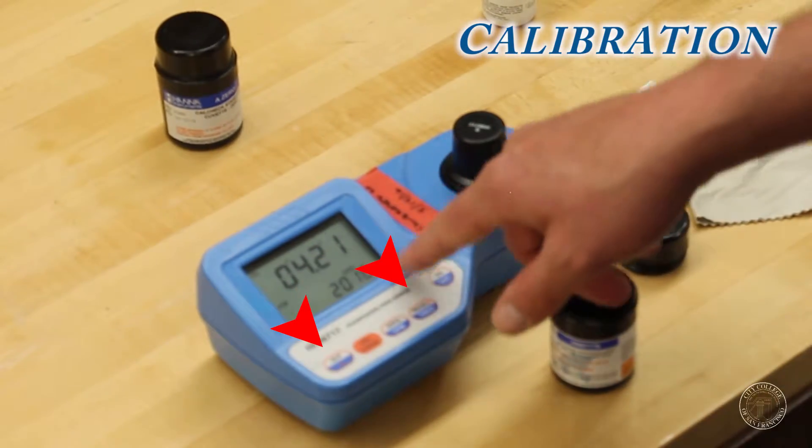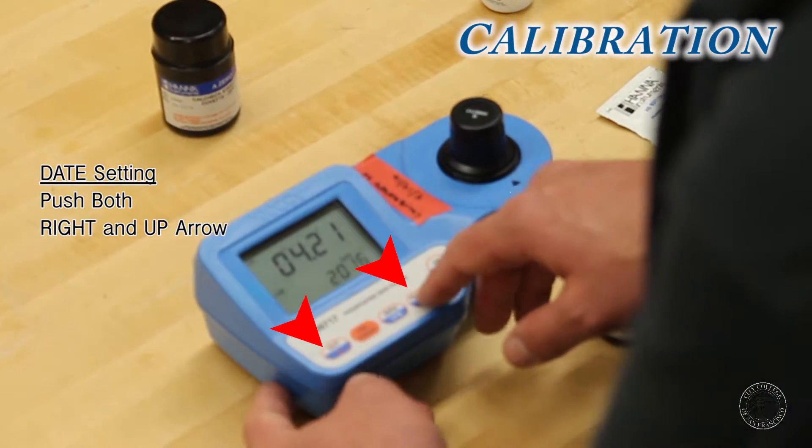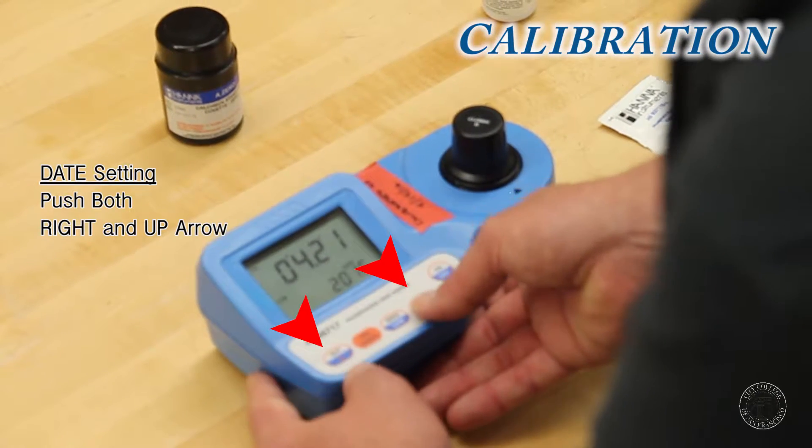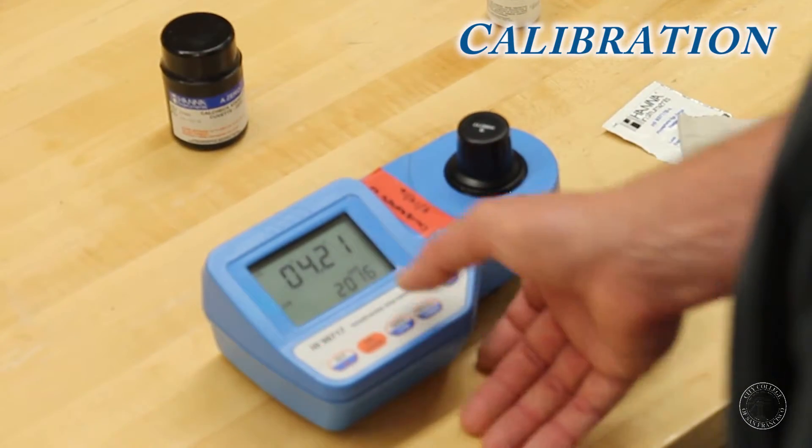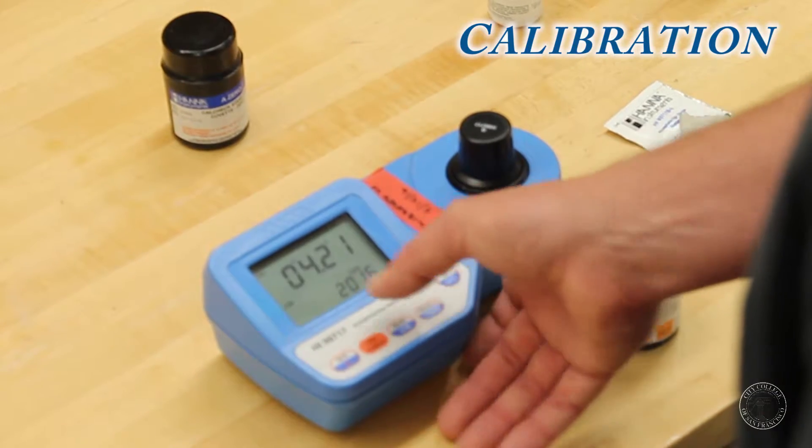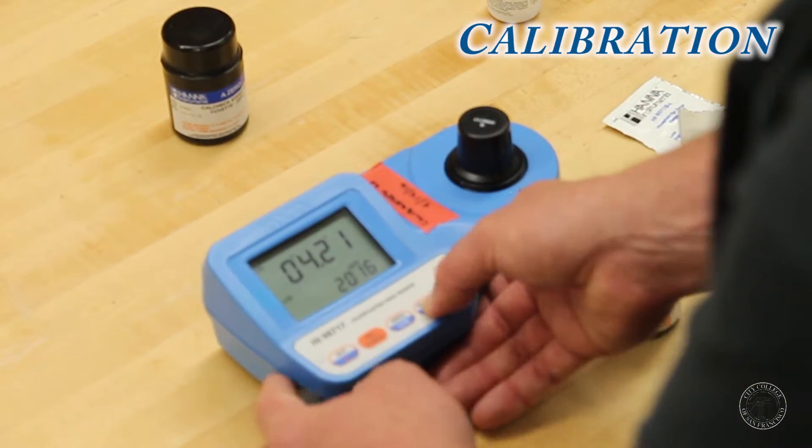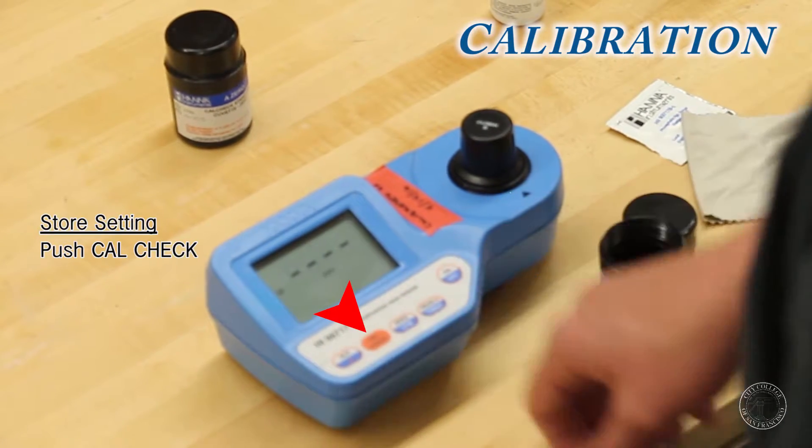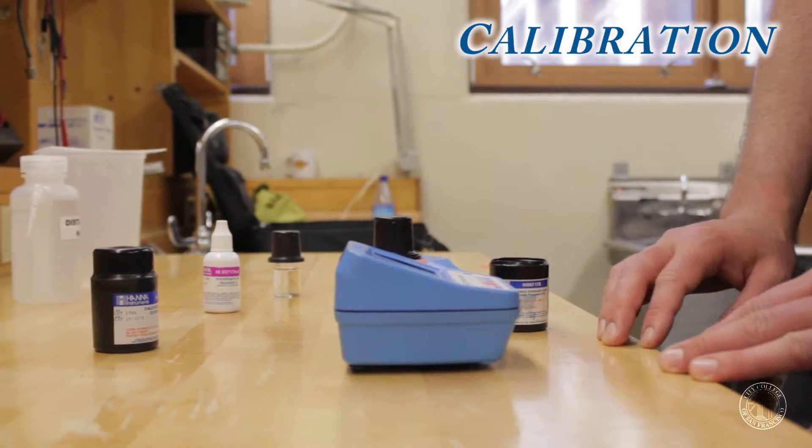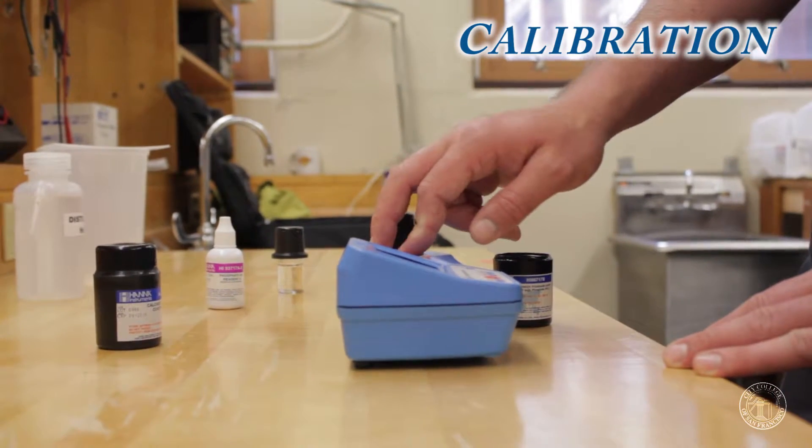Every time you calibrate it, it wants a date set. So using the right arrow and the up arrow, you can transfer between the year, the month, and the day. So this is set for 2016, April, and 21st. And that is correct for us here. So then you just hit CalCheck to store everything. Now the calibration is stored and the machine has been calibrated.